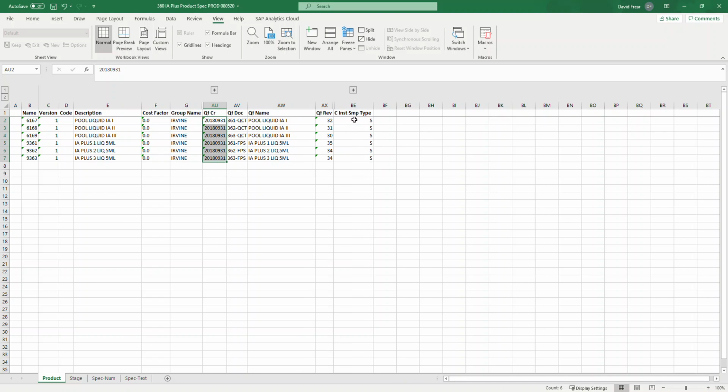This is one of the different features here. We need to make sure that we put in the sample type, so serum, plasma, CSF, those go here. Once it's established for a product, it shouldn't change.